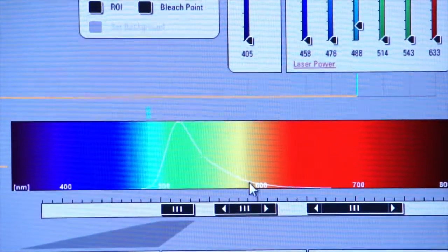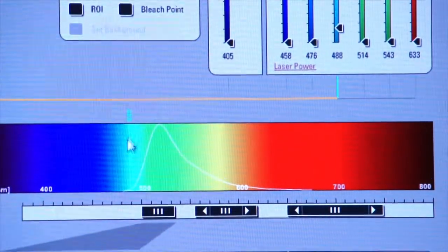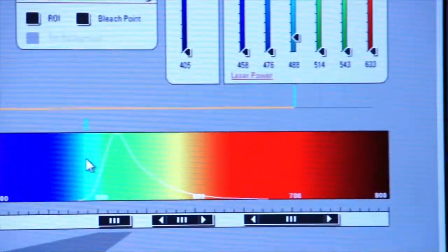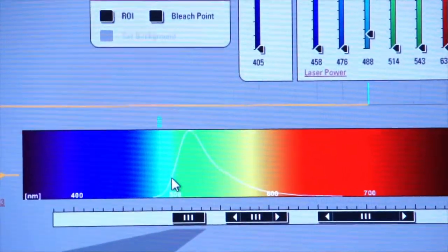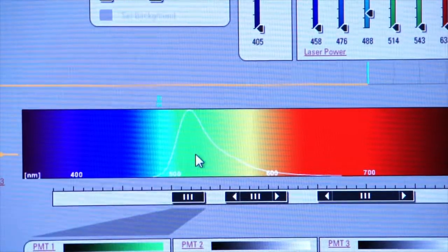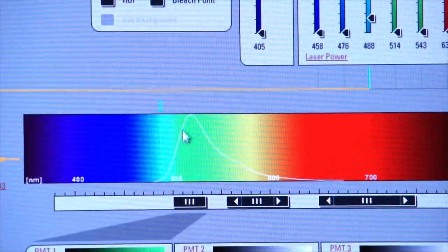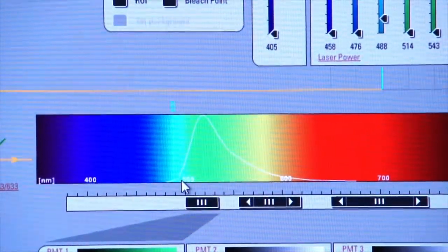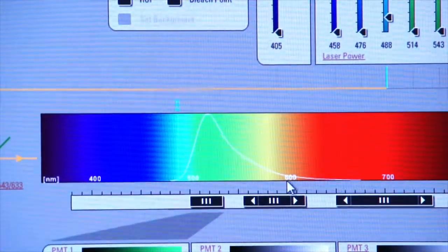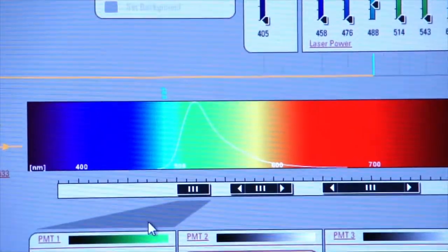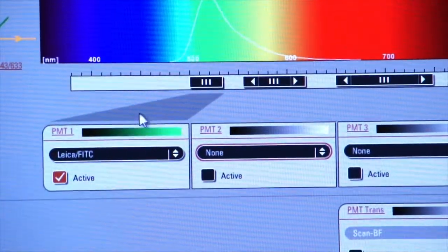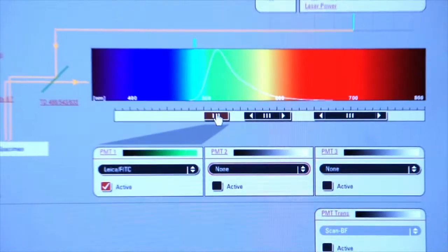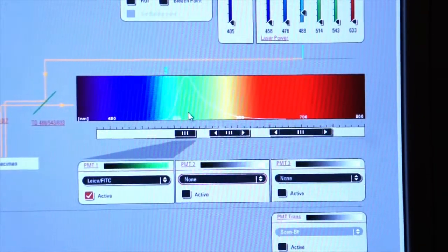And so we know that we're going to excite at 488 nanometers and FITC, fluorescein isothiocyanate, the fluorophore that we've selected for this experiment will yield or will emit photons from about 520 up to almost 600. And so you see that our PMT, our photomultiplier tube, has automatically been activated. We see the gray bar underneath the slider indicating that we're going to be collecting photons from that area of the spectrum.